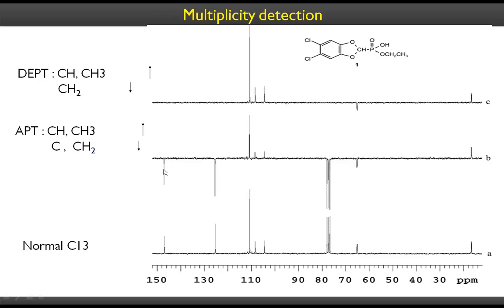And there are some quaternary peaks. There is one here, and there is another one here, so these must be the ipso carbons, right? There is a symmetry here, so you see 1, 2, 3 peaks for this aromatic type. Out of those, these two are the quaternary carbons, the ones that do not have hydrogens, and they are pointing downwards, right? And depending upon the chemical shift, I can assign either to this or to this, these two peaks.